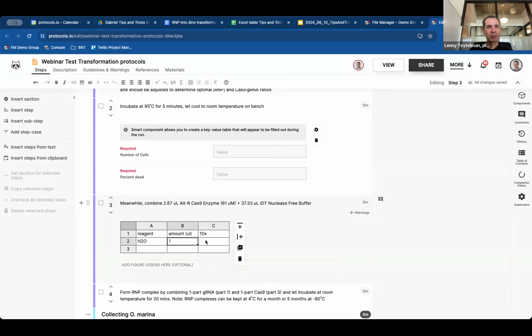So instead of just typing in the fields directly, just as in Excel or Google Sheets, if you put an equal sign in front, you could say this is 10. Now you can enter formulas, 10 times cell B2. And if you double click, you'll see the formula, right? So you can now start working with the table.